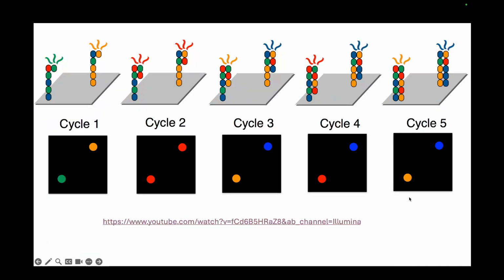So the output of the base caller is basically a probabilistic value along with the base that is present there. So at that position maybe there is a base A with, say, 95% probability. So it's all based on probabilistic values, because you do not know exactly what the base there is. You are identifying the base using a proxy of this light that is getting emitted when that nucleotide is getting added to the sequence. So yeah, it's a very interesting and very useful process that we have in Illumina's short read sequencing.